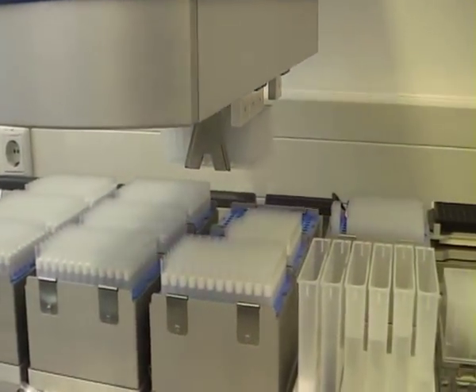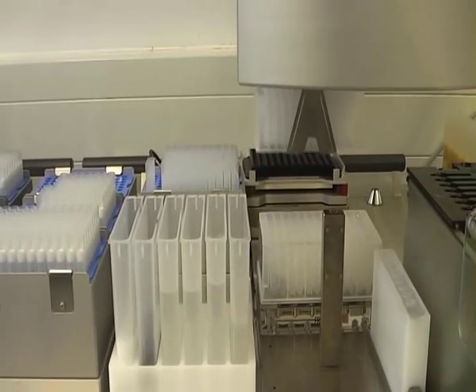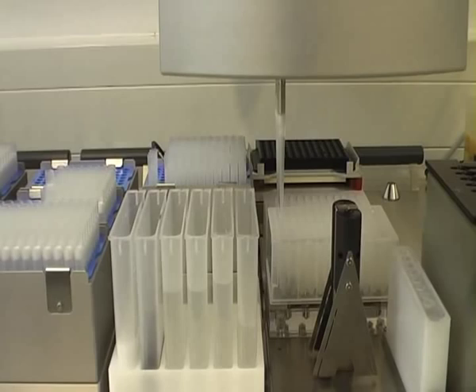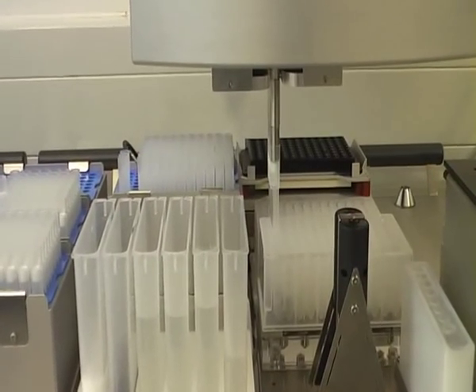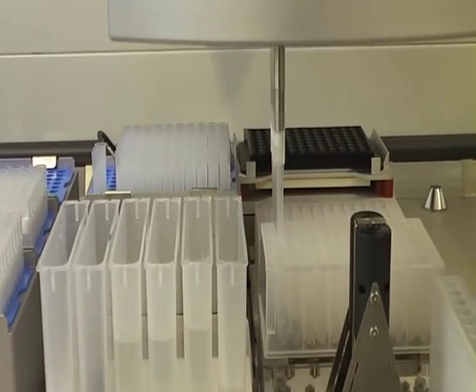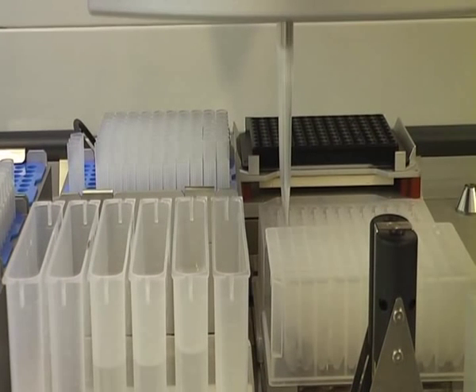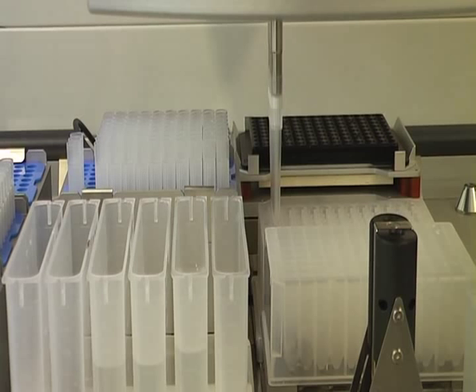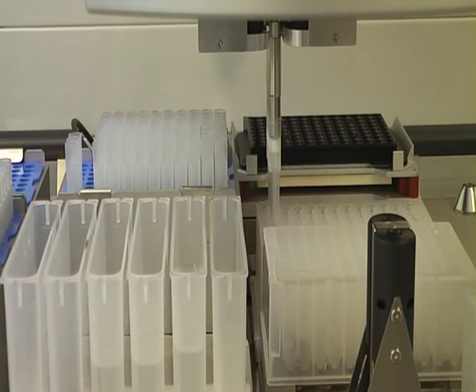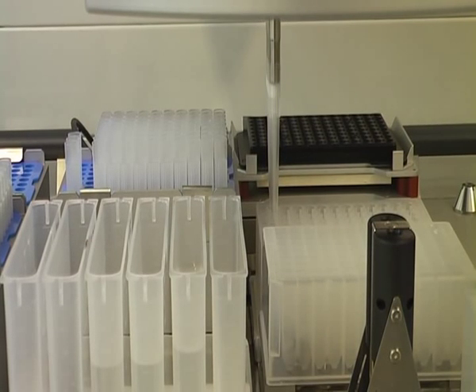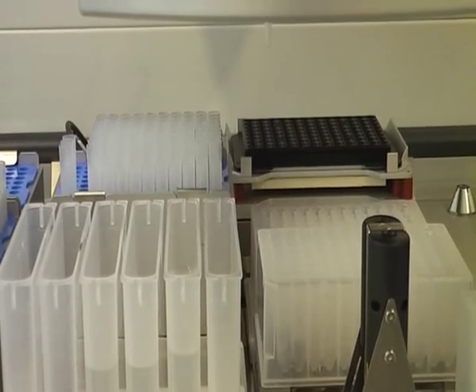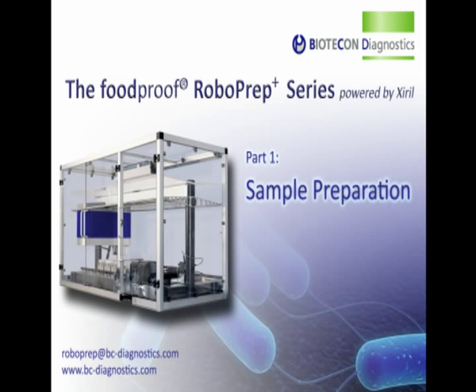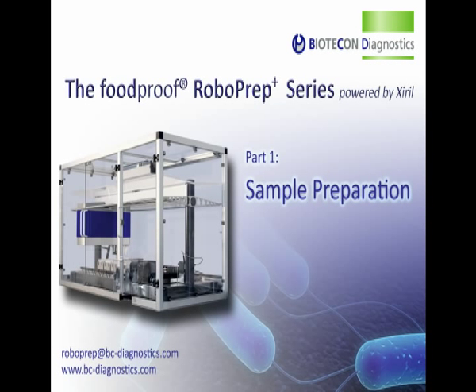In the final step, a new plate is transferred to the work position. The purified DNA is now transferred to this new plate. 5 microliters of this DNA will be used for the subsequent PCR setup. The entire process of DNA extraction and purification in order to avoid PCR inhibition is complete in just 2 hours and 20 minutes for 96 samples at one time.